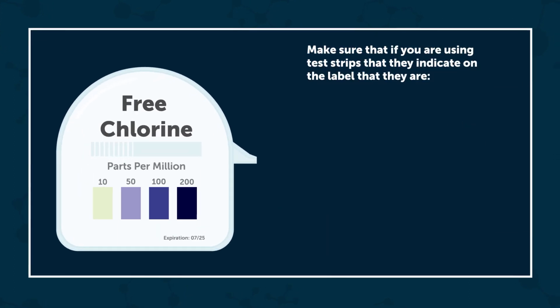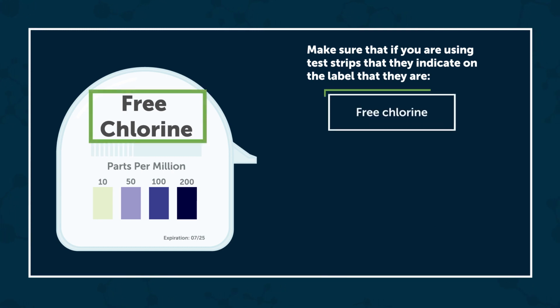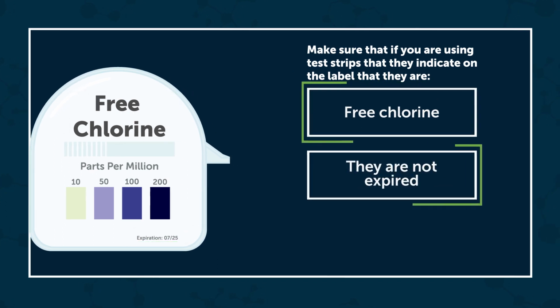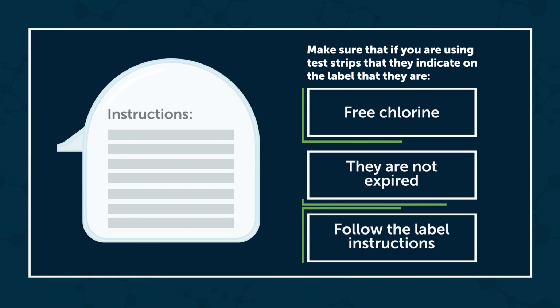Note: make sure that if you are using test strips, that they indicate on the label that they are specifically for free chlorine and that they are not expired. Also, be sure to use them according to the label instructions.